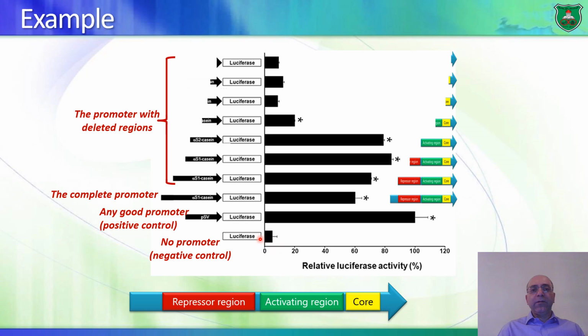Now you see a little signal right here. This could be something like leakage of expression. It could be just background color or light. It could be anything like that. So this is the negative. This is the sample where there should be no luciferase, or little luciferase.